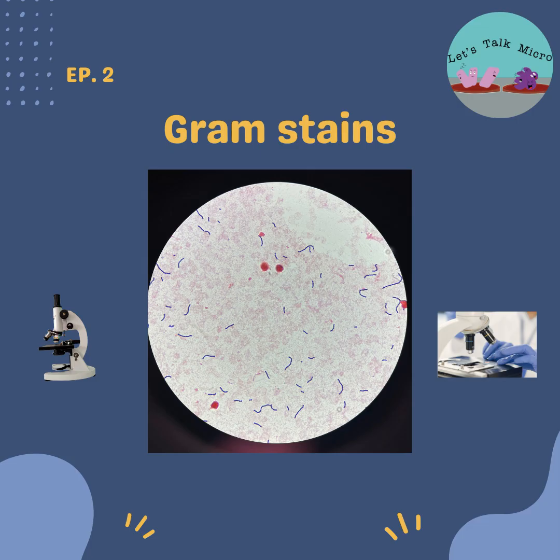So this gives you a mechanism to identify the number and type of cells in a specimen, like white blood cells, epithelial cells, and the main organism. And then you have your indirect smear, which is when your primary sample has already been processed in culture. So you plated it on the agar, you incubated it, and now you have organisms growing. And then you grab a colony of what's growing and you make a slide out of that. And that's called an indirect smear. So when you're reading on your benches, like your wound bench, your urine bench, you are doing indirect smears because you already have the organisms grown. You're not dealing with your primary clinical sample. I just want to make sure that everyone knows that.